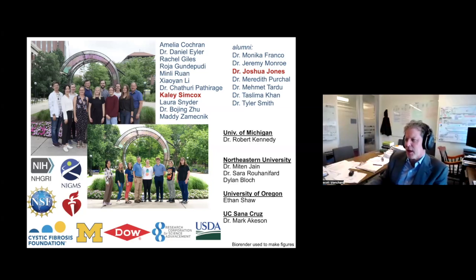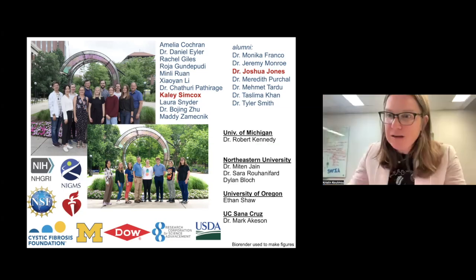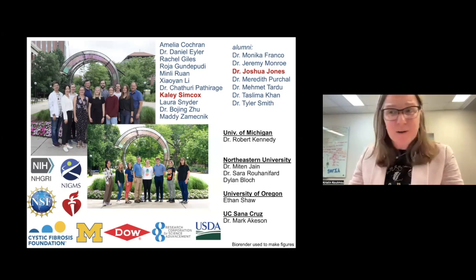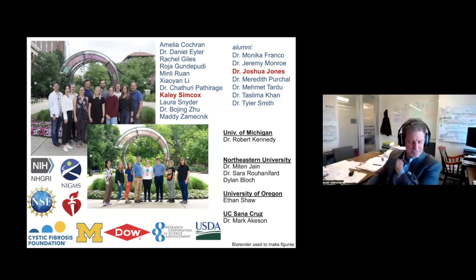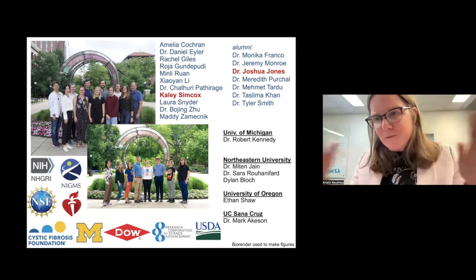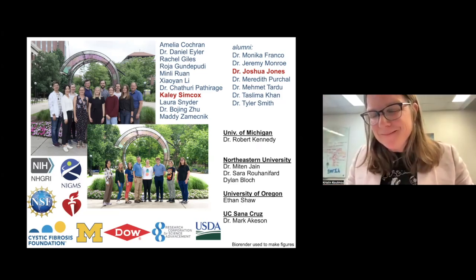While tRNA digested with RNases produces longer fragments, how do you confirm the location? That's another question. Right. You can confirm the location because these have sequence context. We're sequencing. We're not doing nucleoside analysis. Things aren't being chopped up into nucleosides. These have sequence context, so wonderful. You directly sequence them. Great.